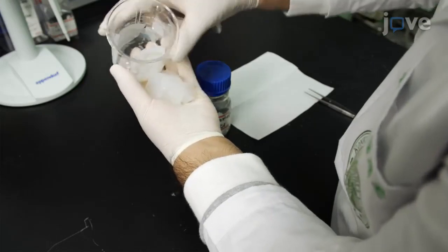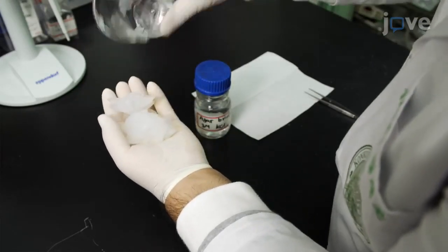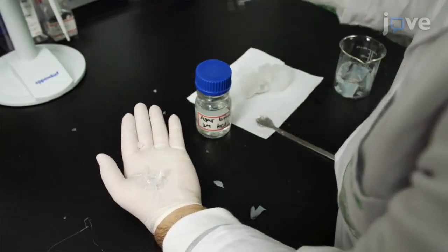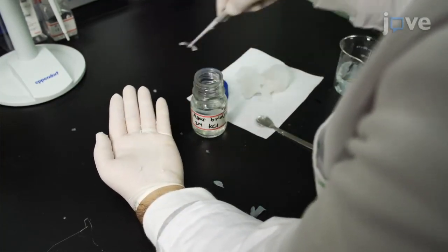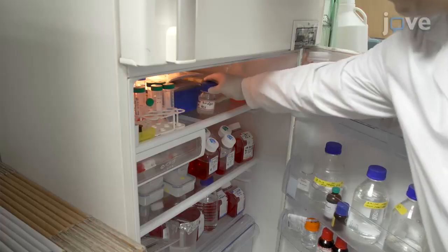The next day, carefully dig out the agarose potassium chloride loaded glass bridge from the hardened agarose salt. Store the bridge in a wide-necked bottle of 3 molar potassium chloride in the refrigerator.